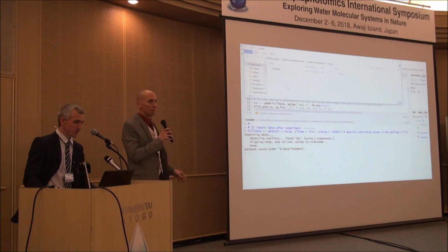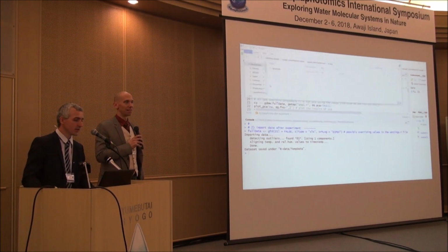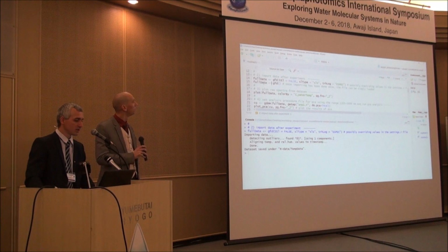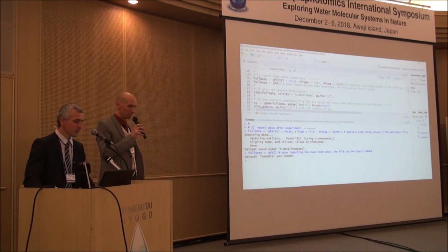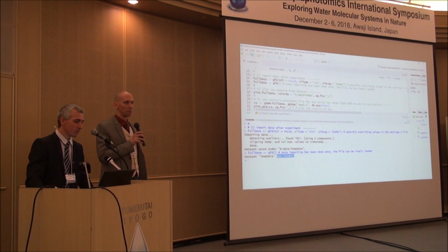Okay. Yes, so with this single one function, this structure was built, and you can see a new file in your R data. So it is saved in your disk. Next time when you get back to this analysis, to this project, and run again this function, then it will say the data is loaded. This fusion is not necessary anymore because it is saved in your computer.